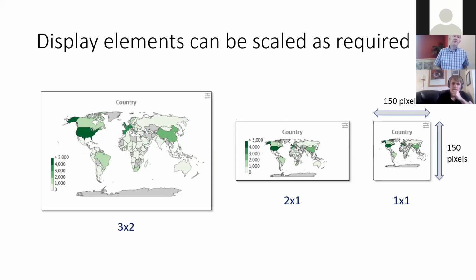Labeling of the visualization is actually one of the biggest problems, because it has to work at very small levels, and you don't want to be overwhelmed by a load of cluttered labels which overwrite each other. So on a big visual, the legend is positioned towards the bottom left.